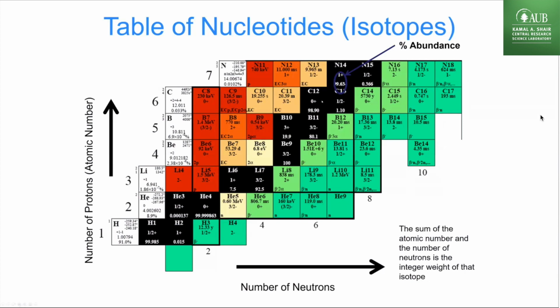And you can see here carbon-12 is 98.9%, and carbon-13, oh, my circle slipped a little bit, carbon-13 is 1.1%. So what does that mean? That means every carbon atom that is in your compound has a 1.1% chance of being a C13.